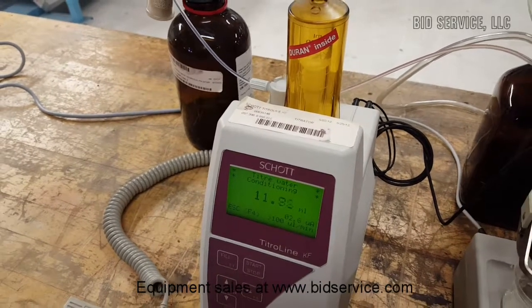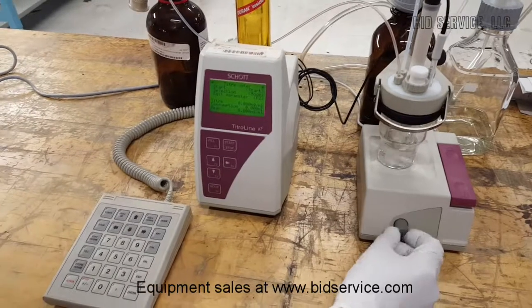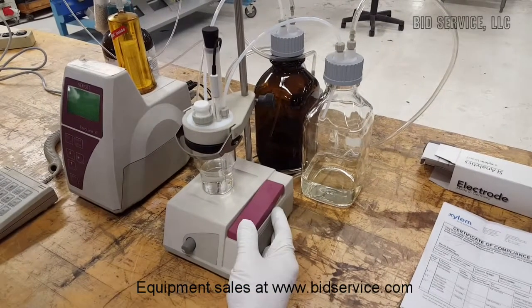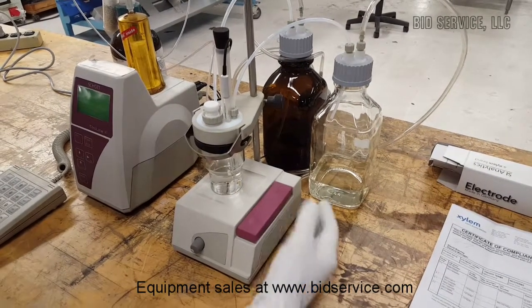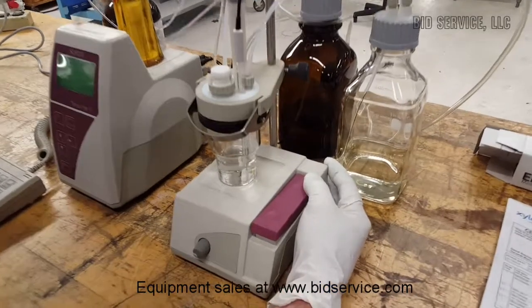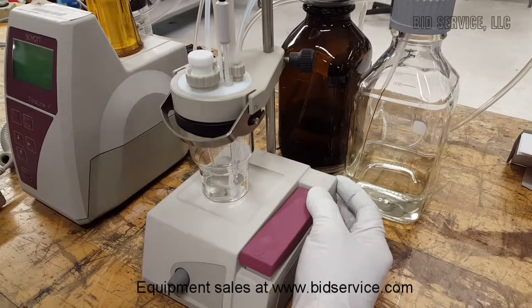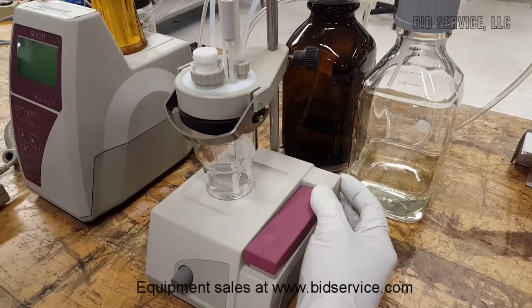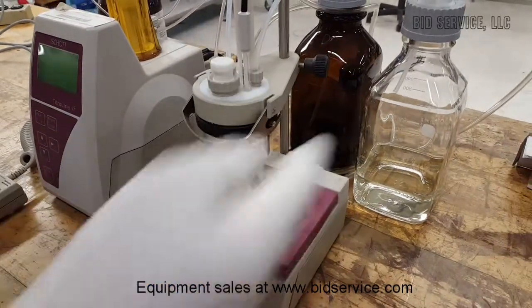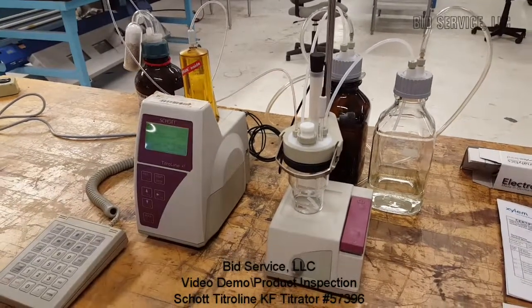At this point, we'll just go ahead and hit cancel by hitting escape. We'll shut this off and we'll drain out the titration vessel. So again, without the proper solvent and titer, you really can't do an actual titration. But at least here we're showing you that all the equipment is operational.